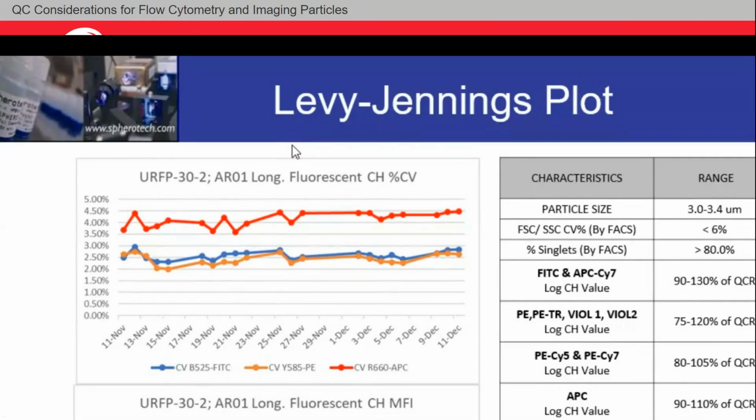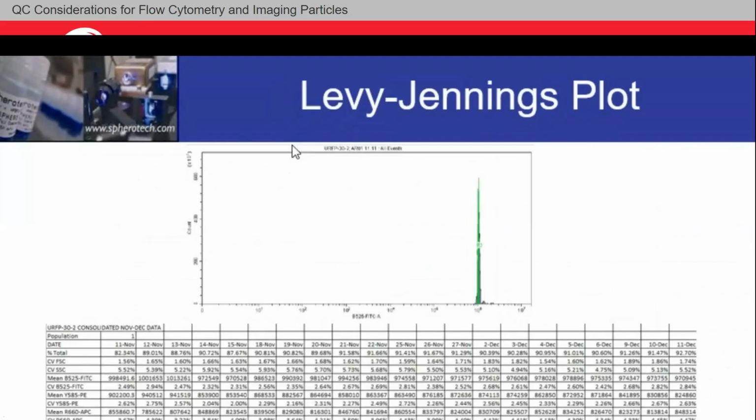So this is what we mean when we say alignment. We're looking to see, is the MFI, is the mean fluorescence intensity reasonably stable? If I put this peak at 10 to the 6th, or if I put this peak at 10 to the 4th, and this says 90,000 or 50,000, is it going to stay within a specific parameter? It looks like this channel might vary by, this is what, 900,000? It might vary by about 50,000, but it's not really jumping outside of that range. I don't see any 70,000s. I don't see any 100,000s, right?